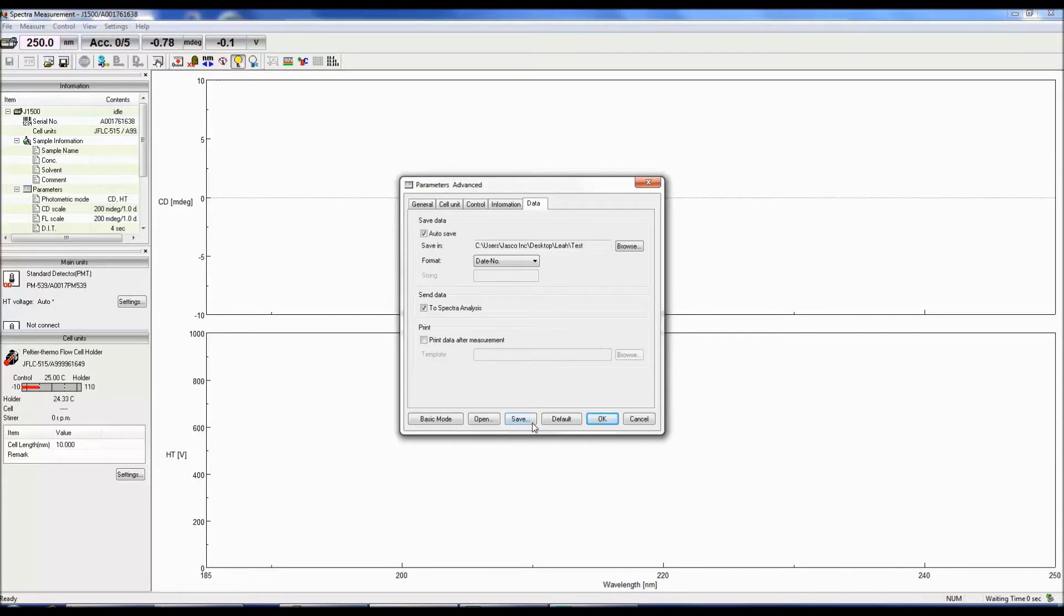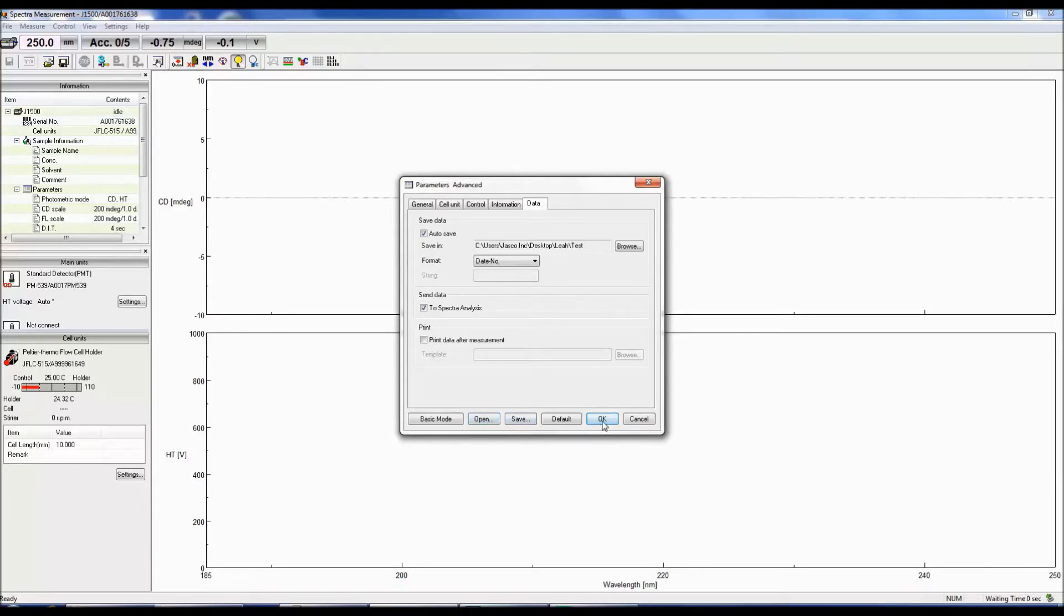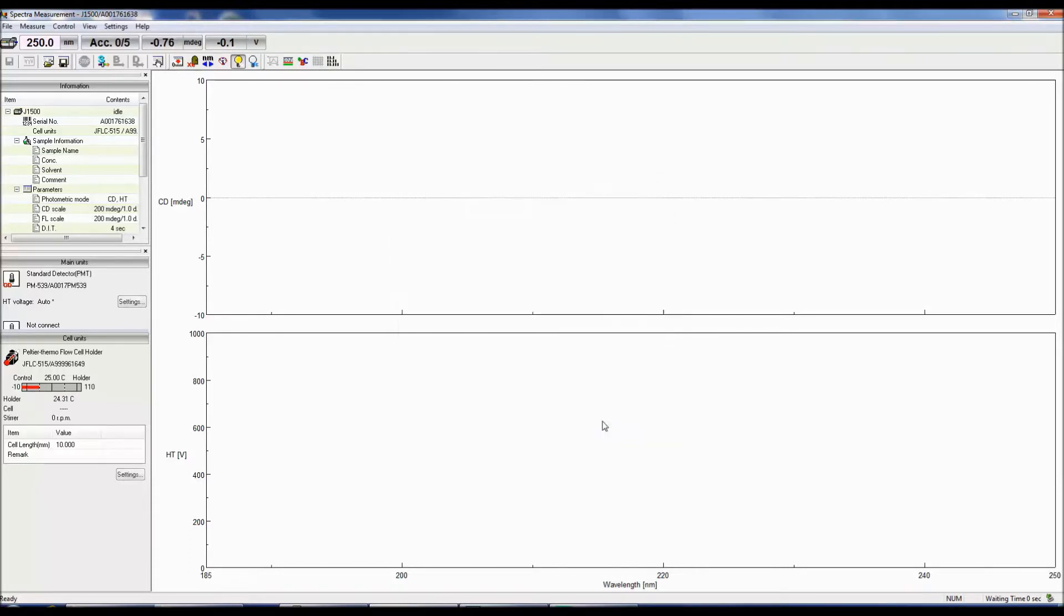You can also save your measurement parameters as well as open previously saved parameter files. Click OK to set the specified parameters.